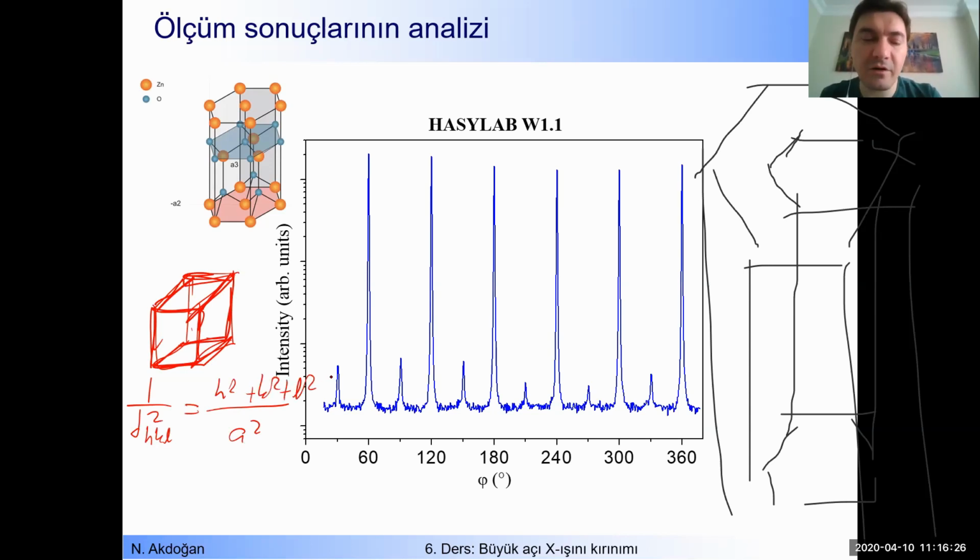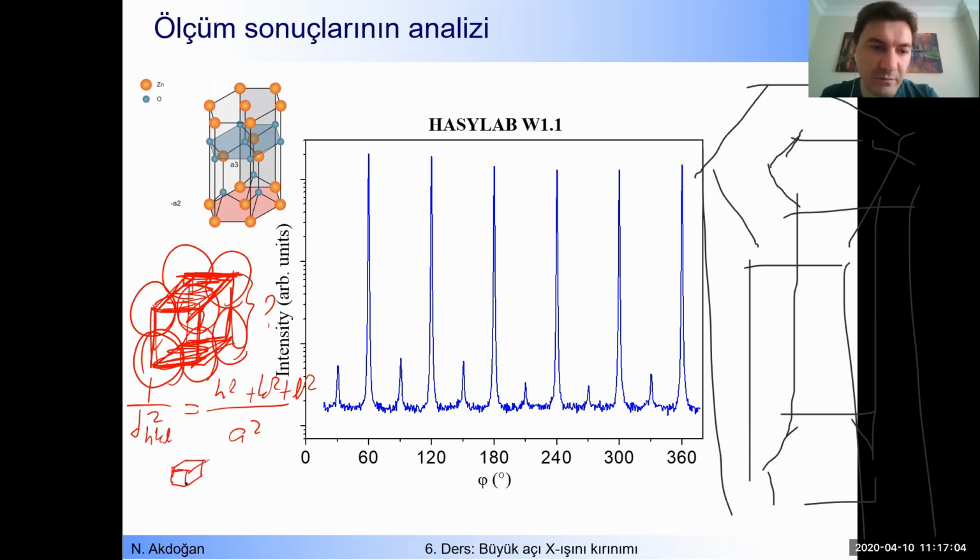Okay. So at the beginning, you have bigger atoms, let's consider. So the interplanar distance between that surface and that surface is given by that quantity. So what is the lattice parameter? The distance between the atoms. You see like this. If you use smaller atoms, just use smaller atoms. What do you see here? That both the interplanar distance and lattice parameter are decreased.